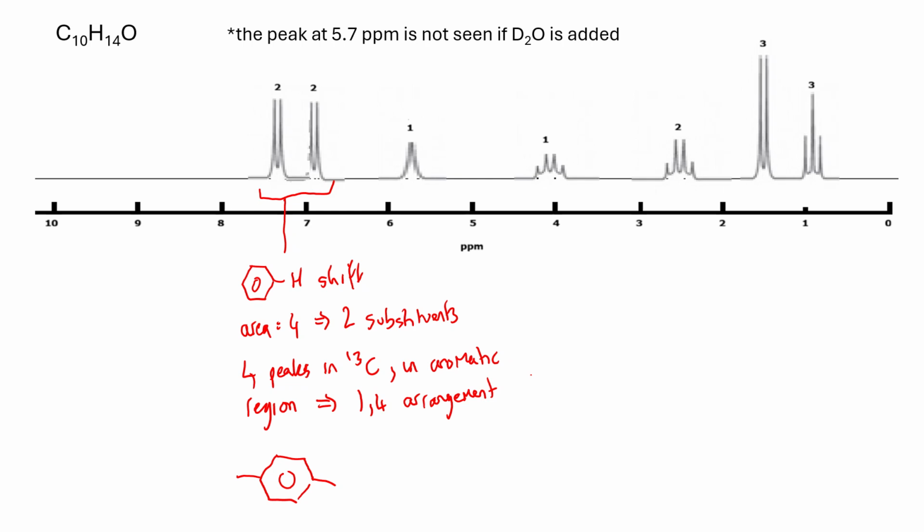So there's no point spending any time writing about it in your answer. Actually, though, you can see that having 2 doublets there fits this as well, because this hydrogen is going to be split by that one, and not by any other, because obviously there is no hydrogen on the adjacent carbon on that side.